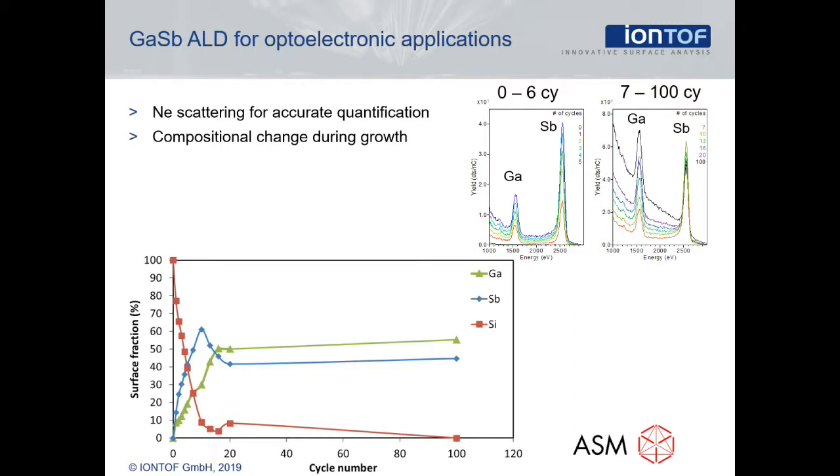It is important to realize that this can be viewed as a depth profile of the complete 100 cycle film, from the interface to the surface of the film. The 100 cycle sample has gone through all these concentration changes, which are most dynamic close to the substrate, before the film is closed. However, a sputter depth profile, for example using SIMS, will not be able to quantify the large changes in the matrix composition close to the interface, as the SIMS matrix effects are very strong. Other techniques are not capable of delivering sufficient depth resolution to resolve these changes.